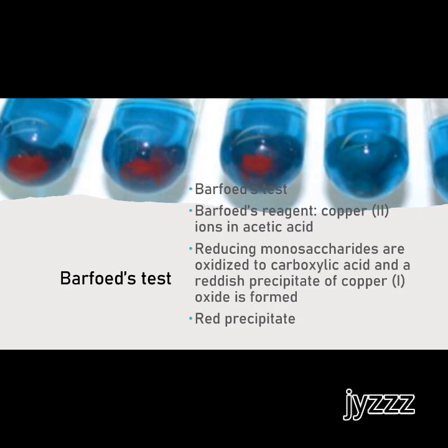This one is a test to distinguish between your reducing monosaccharides and your reducing disaccharides. It will give a positive result for your reducing monosaccharides. Accordingly, your reducing disaccharides will give a slower reaction for this, and that is why this is a specific test for your monosaccharides.